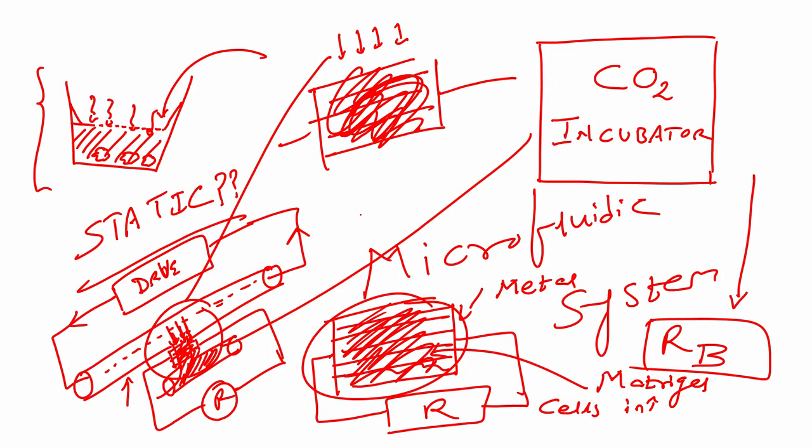When the drug diffuses, if the drug is effective, the cells would lyse, right, they will be fragmented. So, when the cells are fragmented, the constituents within the cell will come out, and that causes a change in the conductivity. Now, that change in conductivity will change the resistance. Right. So, we have a new resistance value, initial resistance value was RB, you have a new resistance in presence of drug 1, let us say, so RD1, correct.